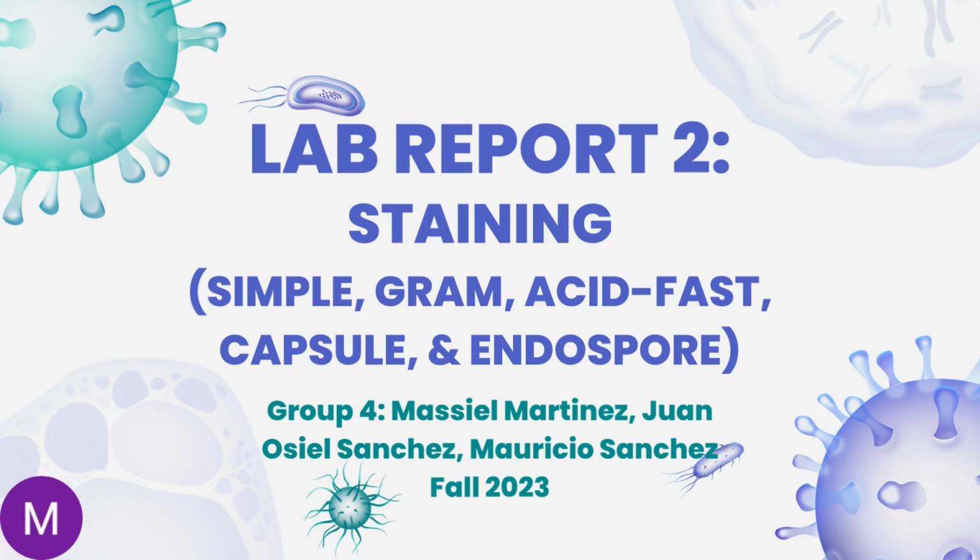This is our lab report number 2. It will be based on staining and it will include different staining techniques such as simple, gram, acid fast, capsule, and endospore stain. This will be presented by Massiel Martinez, Juan Osiel Sanchez, and Mauricio Sanchez.